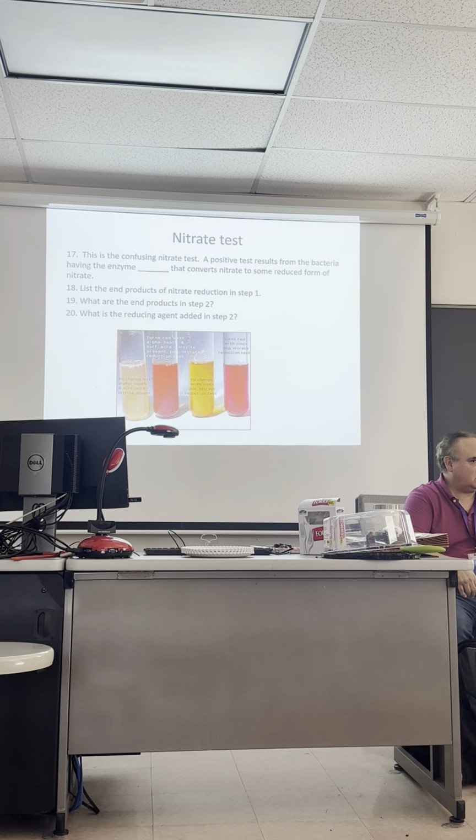And what's the function of zinc? It breaks down nitrate. It's a reducing agent. So once you add zinc and you get a red color appear immediately, what does that mean? No breakdown. No breakdown, negative, right? Or no reduction. If you get no color after the addition of zinc, then what? Nitrate to a gas. Gas present, or we can write it like this.